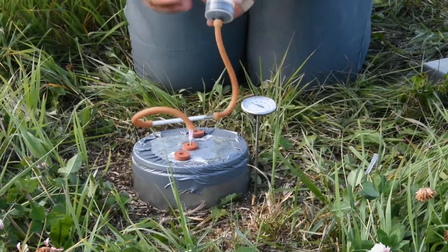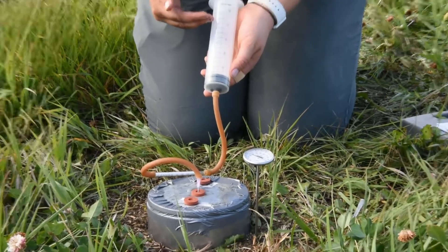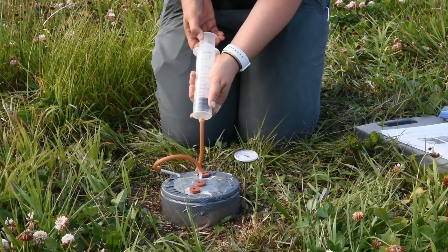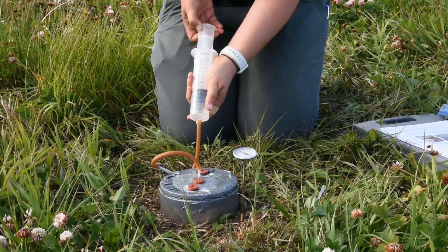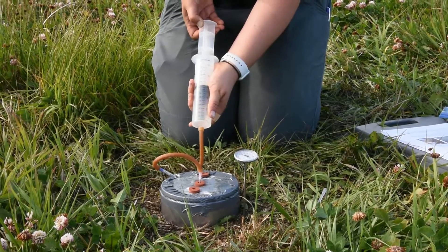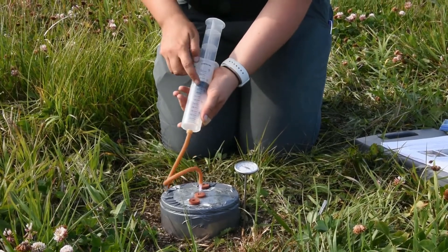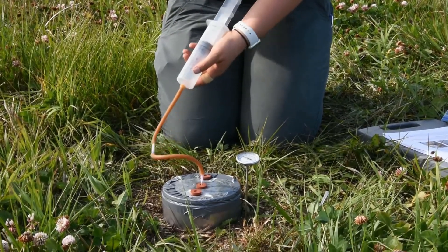Next you want to pull 100 milliliters of air through your syringe. You want the black stopper to be at 100, and it should take about 15 seconds to pull 100 milliliters.